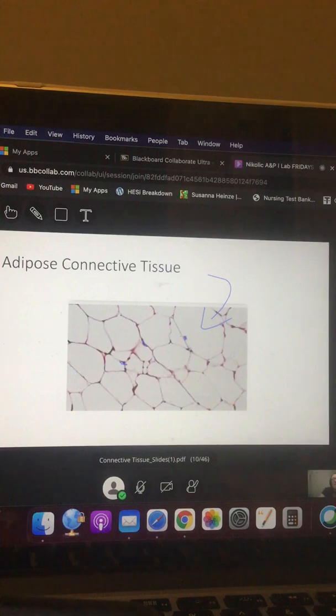And they look like they're outside of the cell, but they're not, right? They're just smushed. Like this one here is the nucleus for that cell. So those are nuclei, but they're just smushed to the cell membrane because the fat vacuole pushes everything to the side. Okay, so with that being said, I'll make sure that this happens because it needs to. It's very hard to tell otherwise.